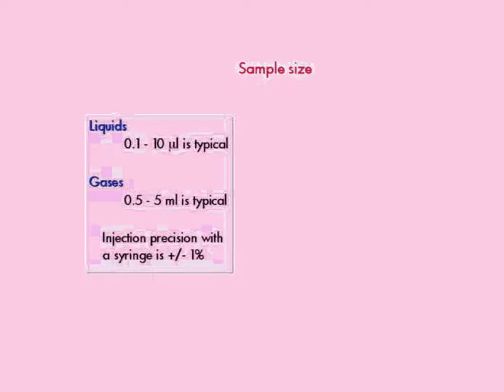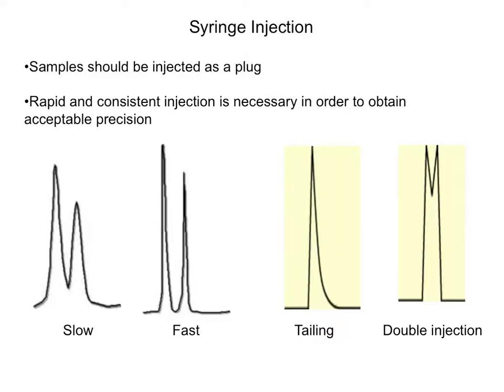We will be injecting about a half a microliter using a one microliter syringe. This amount is so small that if you apply it to your fingernail, you can't even see it. It is important that you inject the sample smoothly and all at once. If you inject too slowly, the peaks are broad and poorly defined, like the first set of peaks. You want your peaks to look like the second set of peaks — sharp and clearly differentiated.